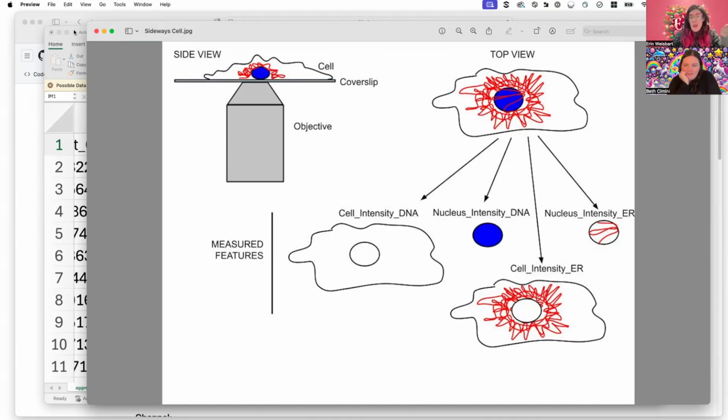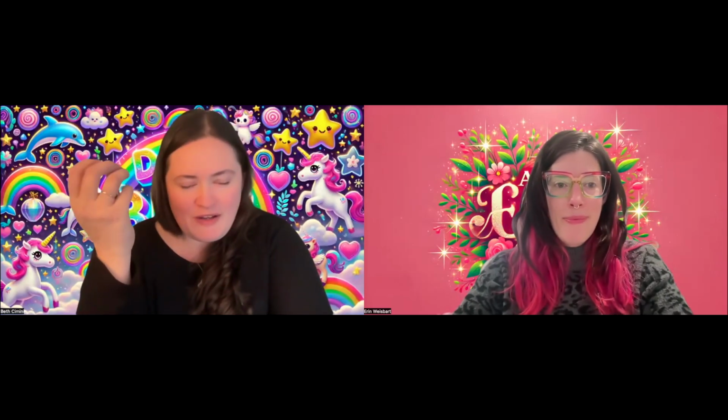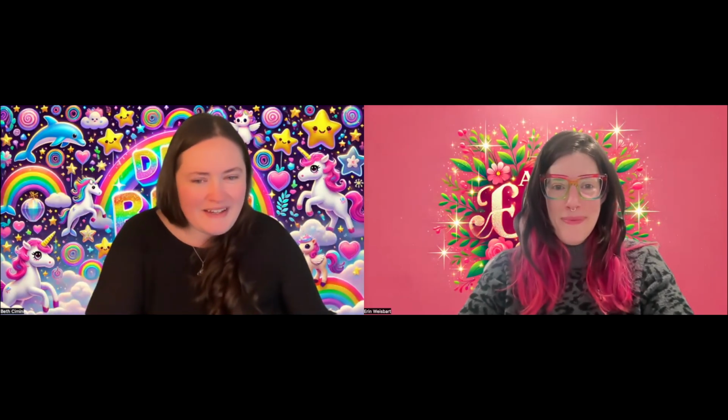I think that's what I wanted to say about CellProfiler features and understanding and interpreting them. Definitely some of them will give you a picture in your head, like if I say my cell has an area two times as big. Others, like the texture measures, are less intuitive, but it should be enough to give you an idea of what's going on in the cell, to help decide what's the next experiment to do.